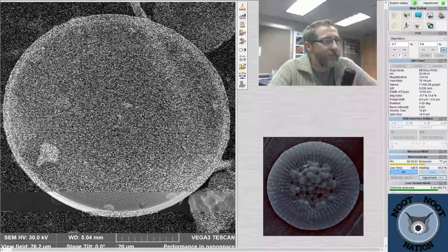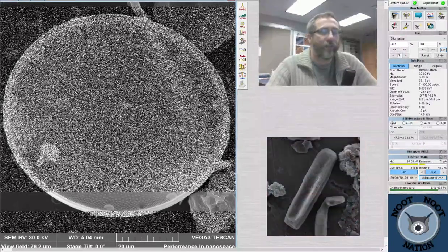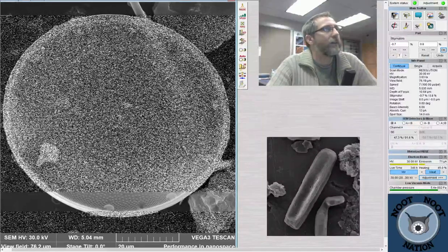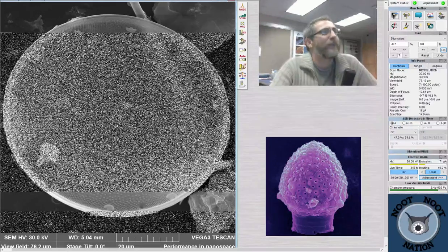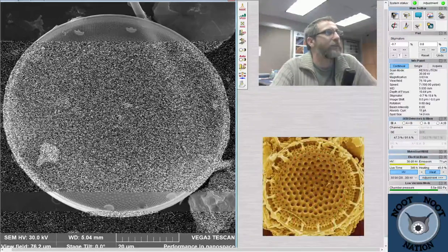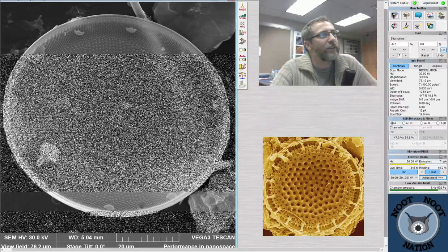So this thing right here is the pseudonodule. It's like a little depression here on the outside of the valve. It would be a bump, like an external bump upward. On the inside, it'd be like a little pit. And I don't know what it does. You should just feel lucky that I could figure out it was an actinocyclus without any help. But I don't know why there's a pseudonodulus or what it does. It's just a thing.